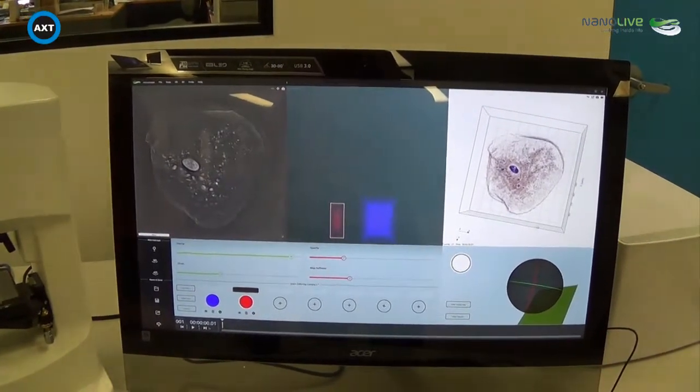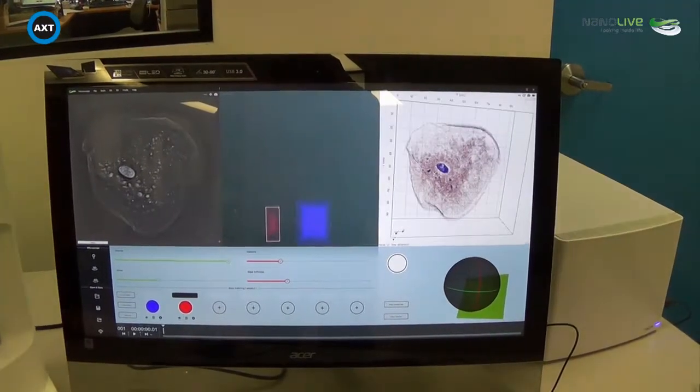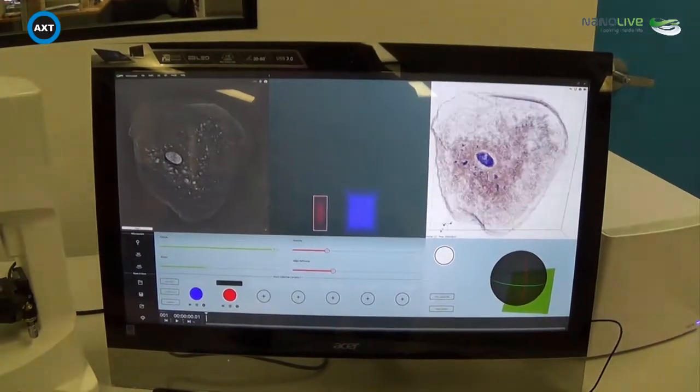And you can do something similar with the 3D image? Yeah, and the 3D image is exactly the same. So find a spot and then just zoom in by scrolling with your scroll bar on your mouse.